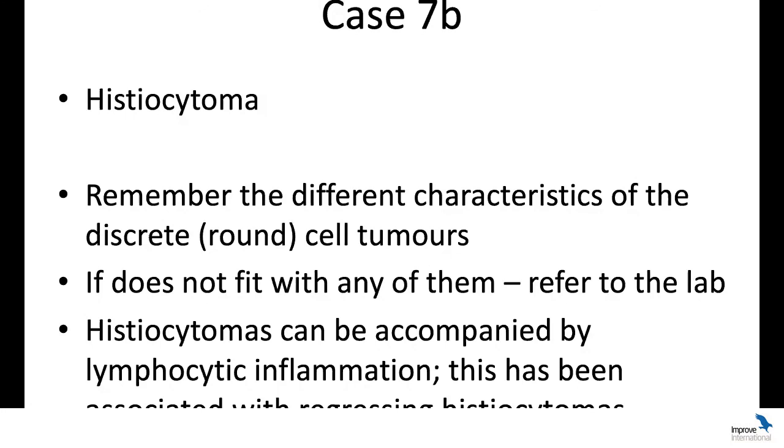Okay, remember that histiocytomas can be accompanied by lymphocytic inflammation, so you can have a lot of lymphocytes there, but those would be small lymphocytes. And this has been associated with the regressing of the lesion, but we can't really predict how quickly that lesion will regress.